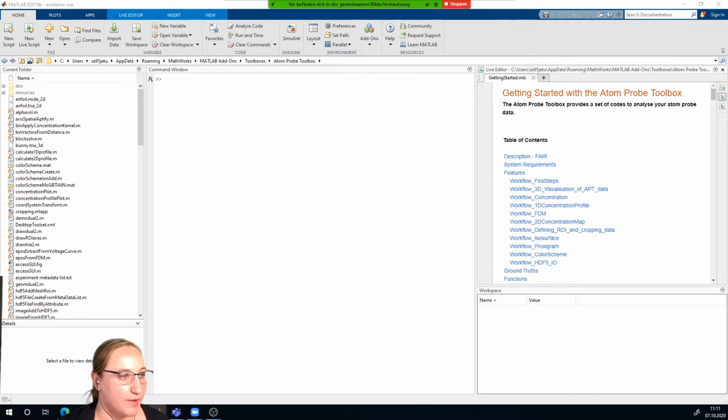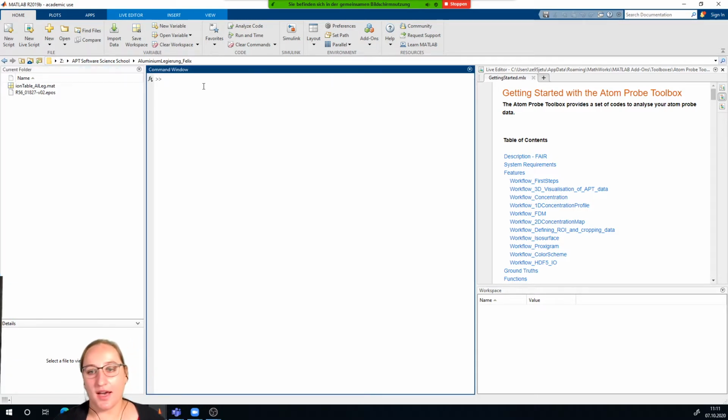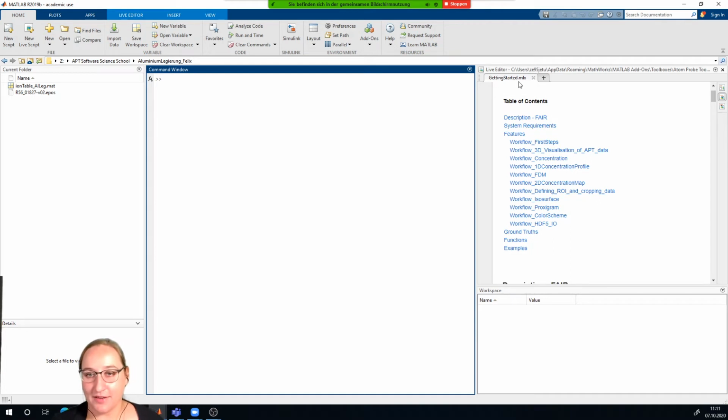Okay, then go back to my working folder. Okay, so I start now from complete the basics again, because I did not load anything in here before. Okay, Peter already mentioned our getting started guide, and I would like to point out really our workflows. So these workflows really helps you through individual steps. If you think something could be made better in the workflows, we are really open to have feedback about them.